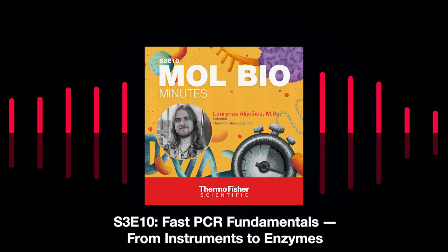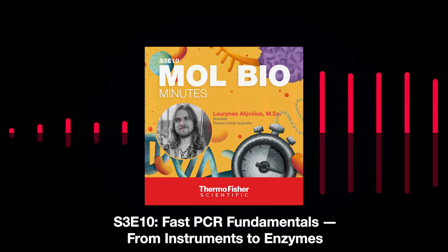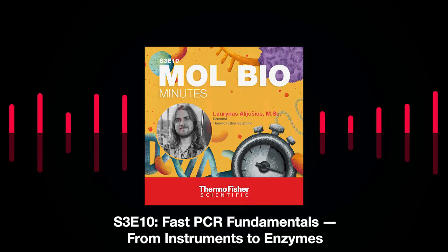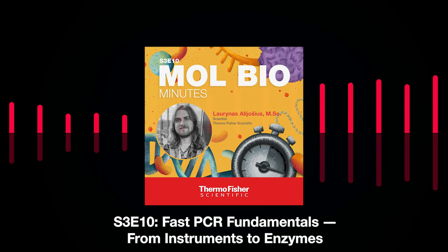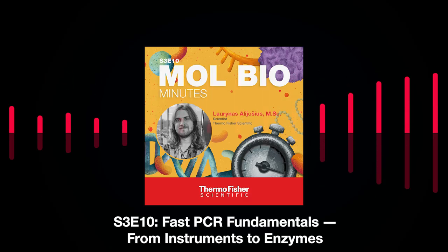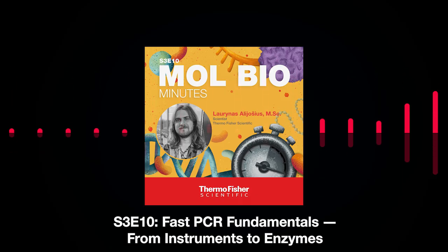Engineered DNA polymerases have multiple other beneficial features. For example, it can be the high fidelity DNA polymerase or thermostable or highly processive. But what do these all terms mean? So let's say if you're using a high fidelity DNA polymerase, this certain polymerase would help you to have less errors introduced during DNA amplification.